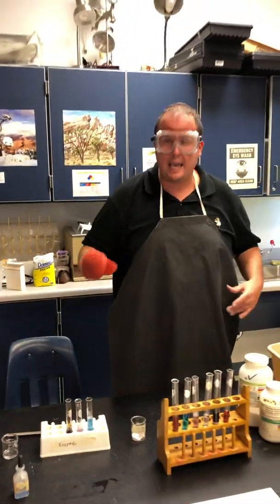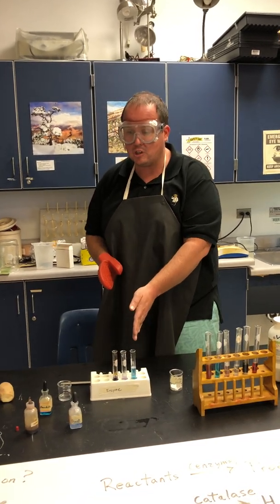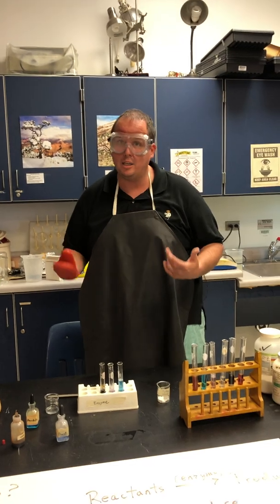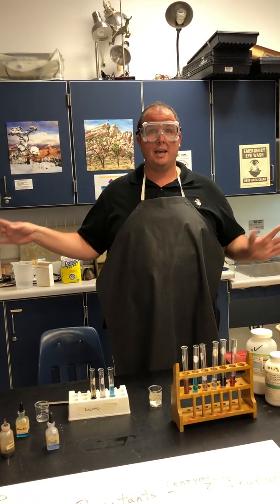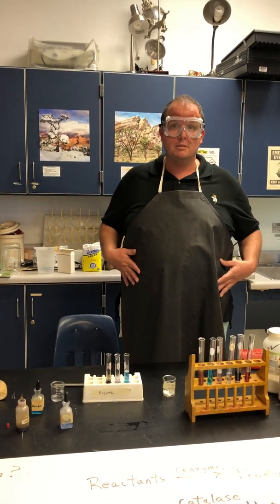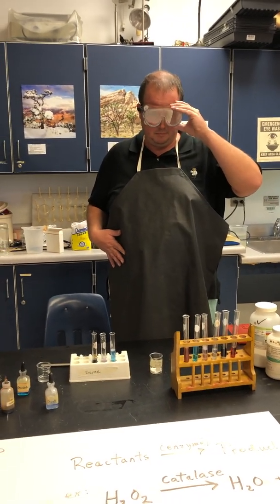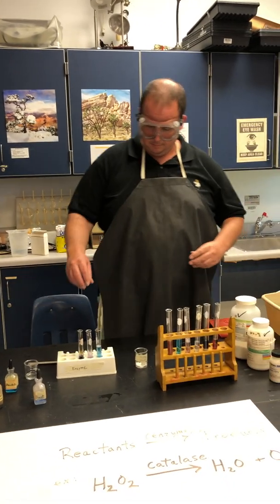Again, ladies and gentlemen, these are what are called chemical reactions, and these are chemical indicators. We know a reaction has occurred if there's a color change. Those are cues to let you know things. Welcome again to the next day of the Chemical Indicators Lab. Ms. Murdoch, anything else? Just make sure you can go back and look at the results again, and you have to decide which things are in that mystery powder and which are not.